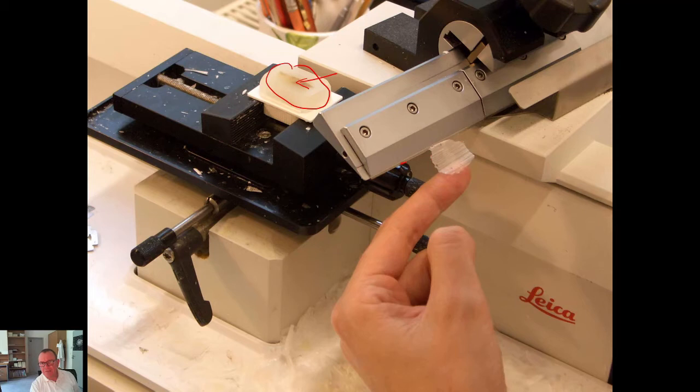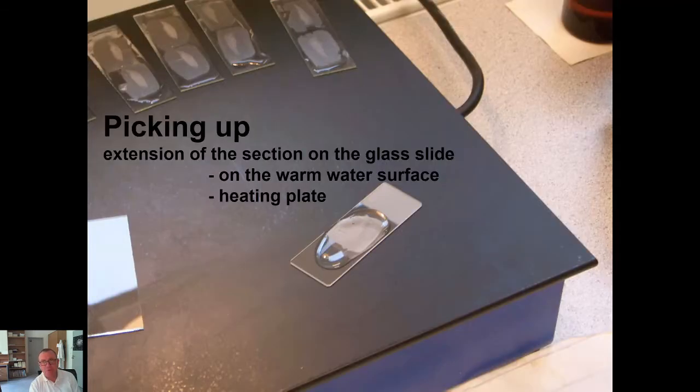This section can then be collected from the knife and put on the glass where a drop of water was given before. Now this thin section is floating on the surface of the drop.